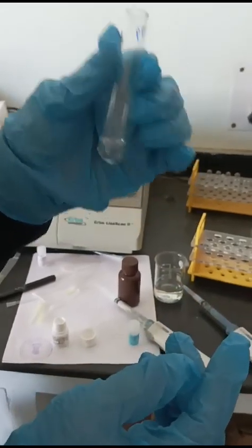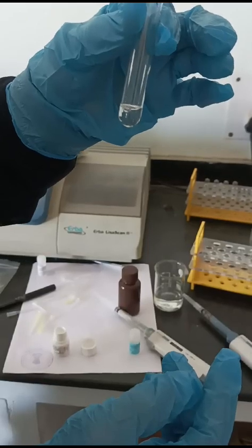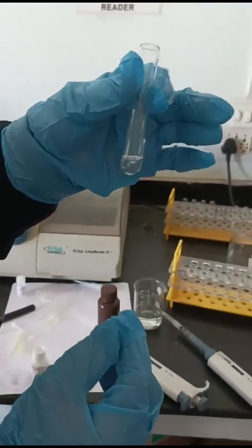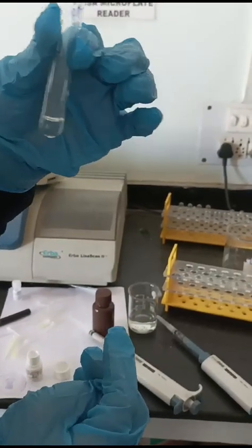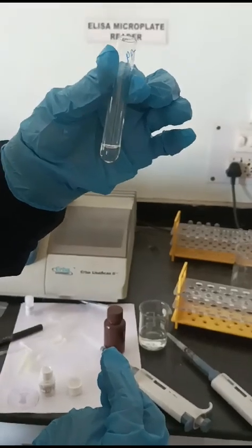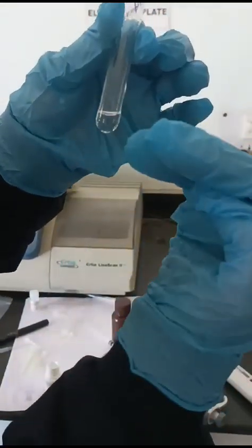We will use this test tube for centrifuge at 3,000 rpm, revolution per minute, for 10 minutes. Once centrifugation takes place, all the precipitation will be settled down.